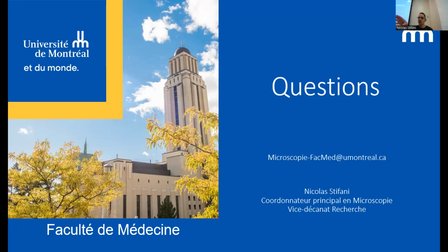But this is not because of the 405 or the 647 themselves. It could be because of the excitation light, the light that goes down to the objective. It's focusing at a different point within the sample, but also on the way back, the light that is emitted by the sample is going to focus differently after the objective. So it's true, but for two reasons: the excitation light and the emission light. And there are objectives that are corrected for that, and I'm going to show details later on.